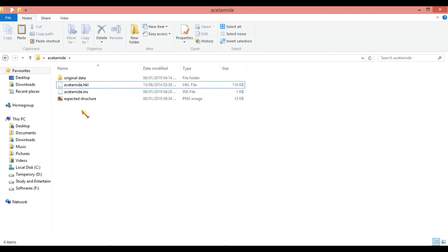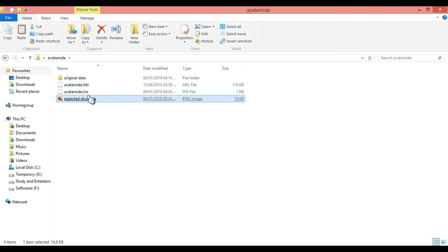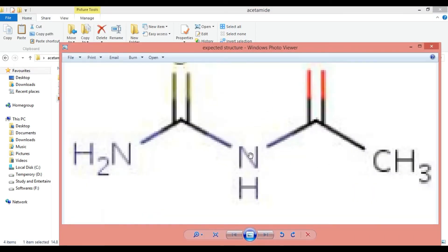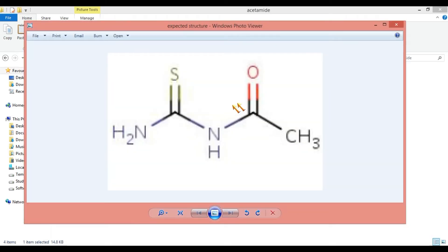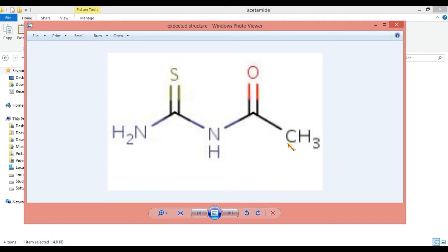Before solving, we should have some expected structure in mind. This is my expected structure which I am going to solve. I am thinking that I may get this type of crystal structure. In this structure, there are two nitrogen atoms, one sulfur, one oxygen, and three carbon atoms.